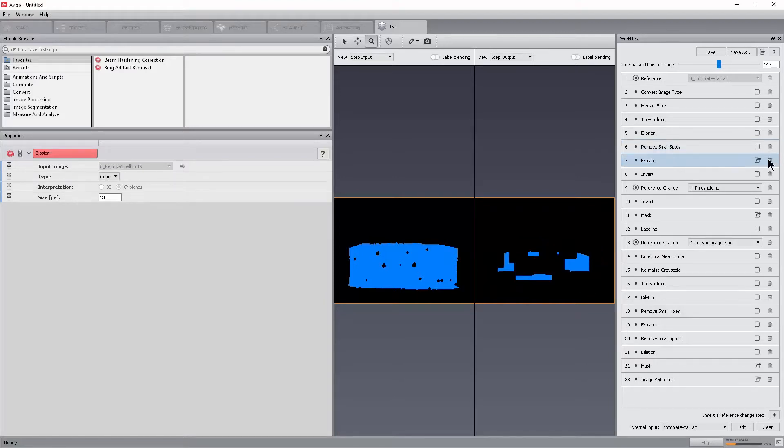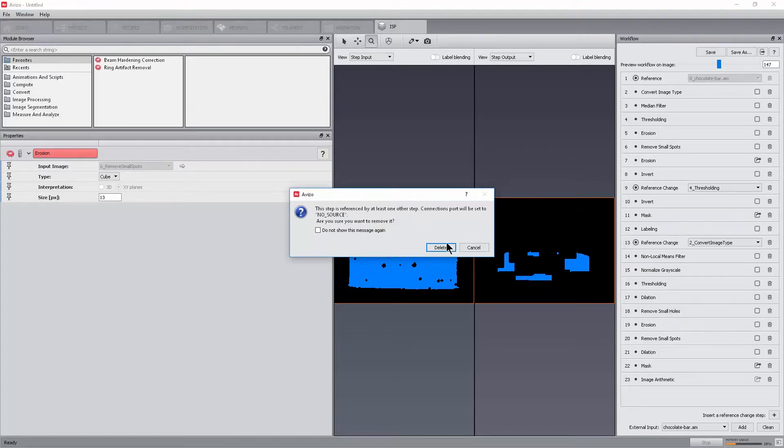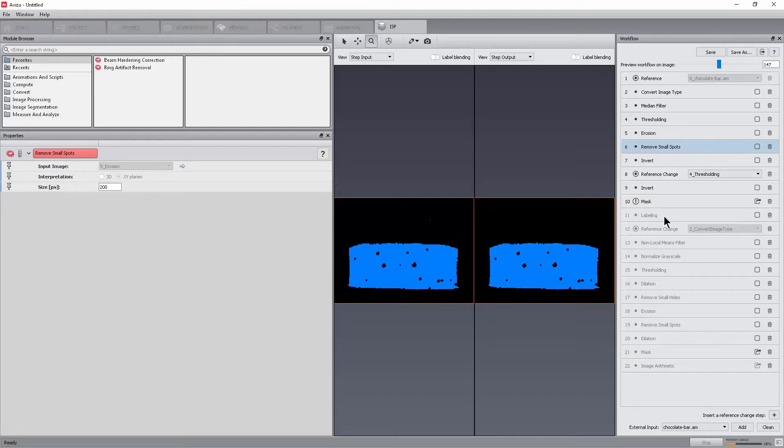Select the erosion step, now step 7, and then click the delete icon. In this case, the workflow panel detects an error and highlights it using the error icon in step 10. The masked step was using the output of the step we just deleted.